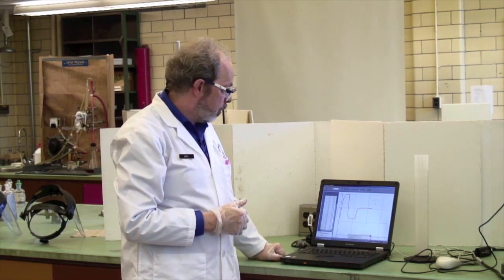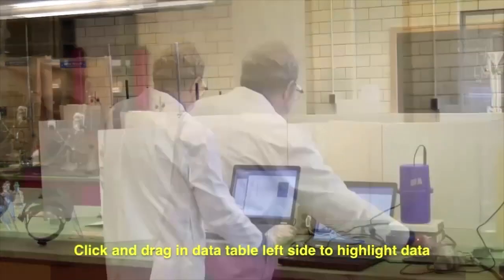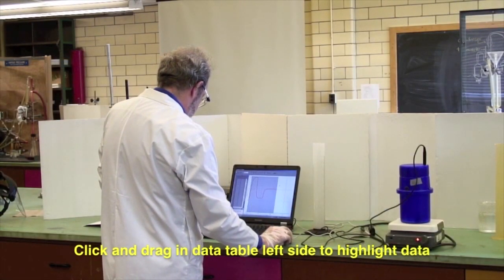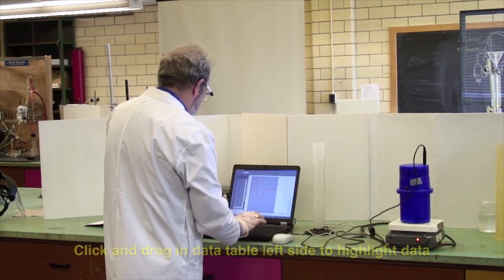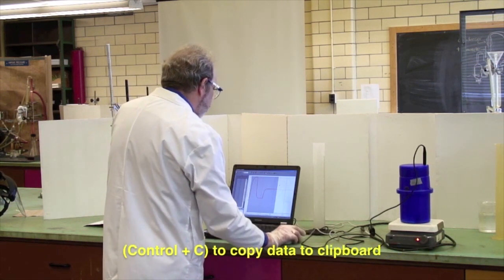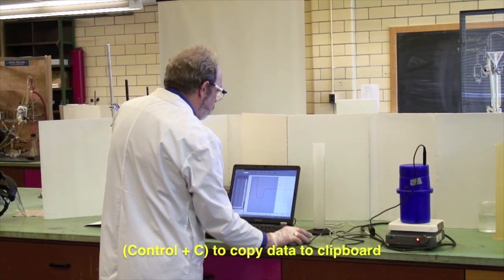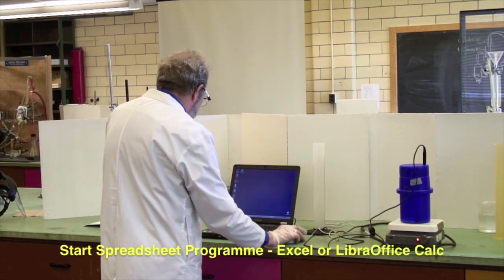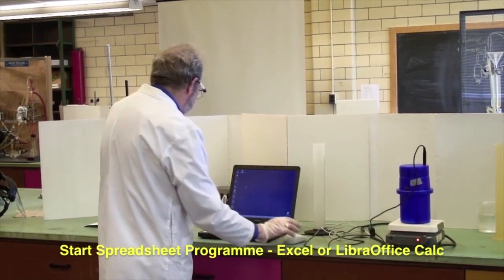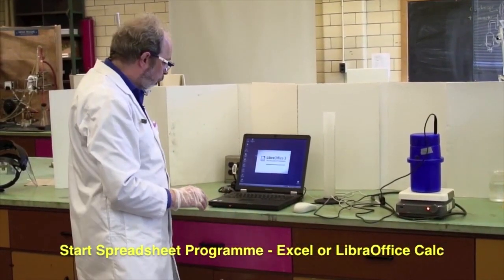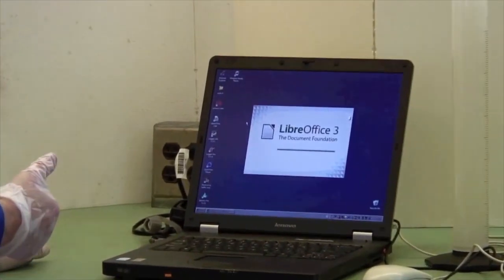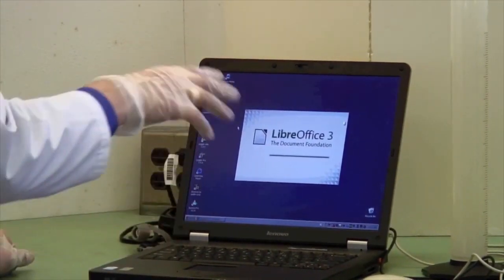The other thing you will probably want is to collect the data. And collect all the data. There we go. And copy, Control C. And at this point you want a spreadsheet program. This particular program calls it LibreOffice Calc. You may have a computer that has Excel on it. But fire up a spreadsheet and copy, just cut and paste the material.